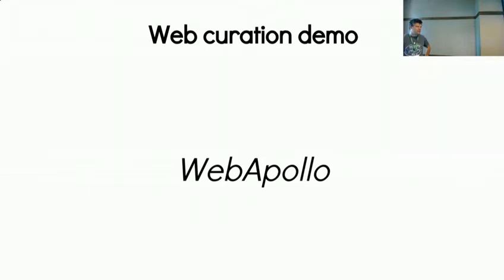So are there any real genome curation projects that are using this? Apollo? Yeah. I'm interested. Is the honeybee, Apis mellifera or whatever it is that they're using, or is this just a demonstration at the moment? Yes and yes. This is being actively used. You just screwed up their annotation. Oh no. Yeah, we did.